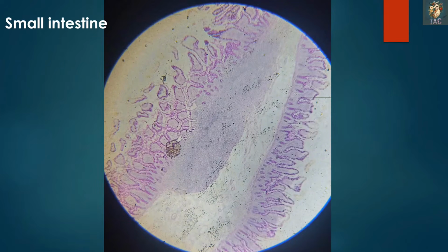First, you should know that this slide is taken at lower magnification, and second important point, the dark color which you can appreciate in these villi, this is basically a slide taken with the stain for the goblet cells. So with this special stain, the goblet cells stain black. The typical microvilli are present, and this whole fold is the plica circularis. So these points help you to identify that this is the small intestine.